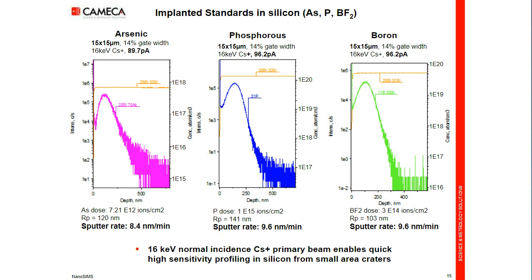And again, the electronic window is positioned after the stack acquisition to optimize the dynamic range. Eventually, for example, if there is a particle in the center of the crater, we can move the window and avoid this defect of the particle inside the crater.